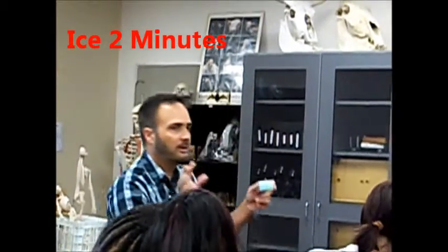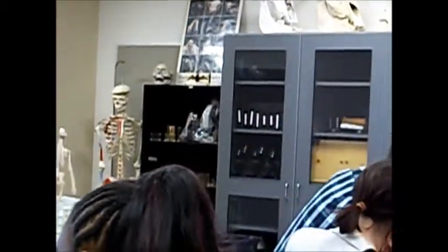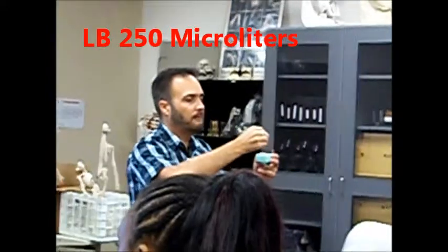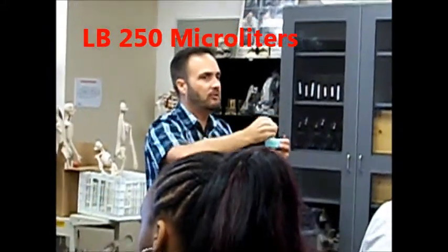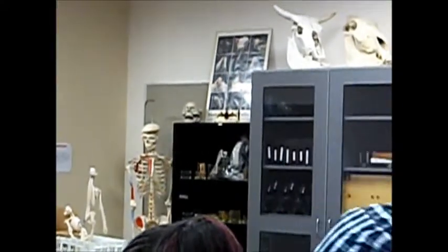Then what you're going to do, because they're going to be massively stressed out when you do all that, right? So what you're going to do is you're going to take this other tube that says LB. What's LB again? The food. The food. And you're going to put 250 of this into each tube, and you're going to let them sit there and relax for a little while and eat and be happy, right? And then you're going to take them and put them onto the little plates.